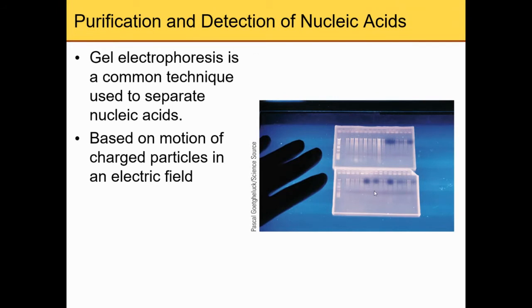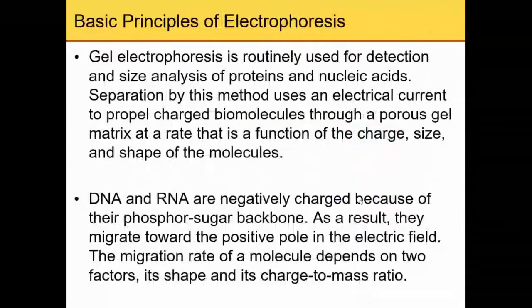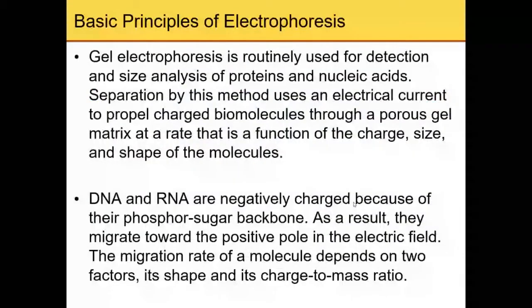So when you perform the gel electrophoresis, because you cannot see anything, you have to rely on these tracking dye, and then to estimate how far your fragment run on the gel, okay? Because if you don't monitor, then those DNA sample can run off the gel, all right? Run off the bottom of the gel, and then you will lose your DNA.